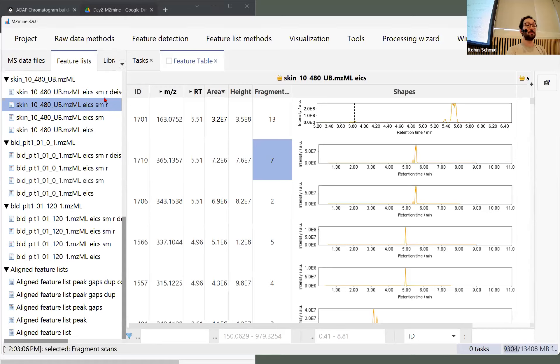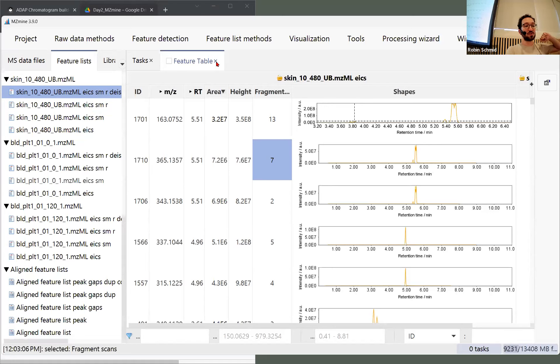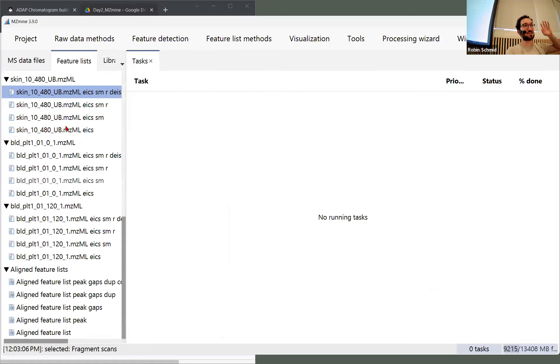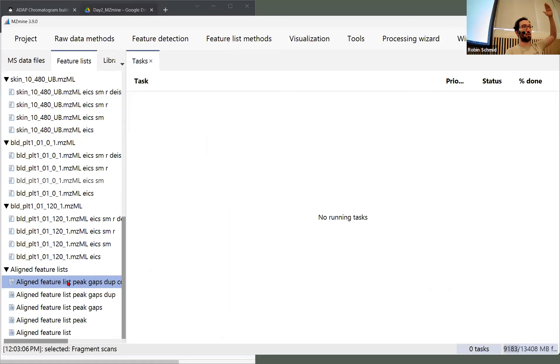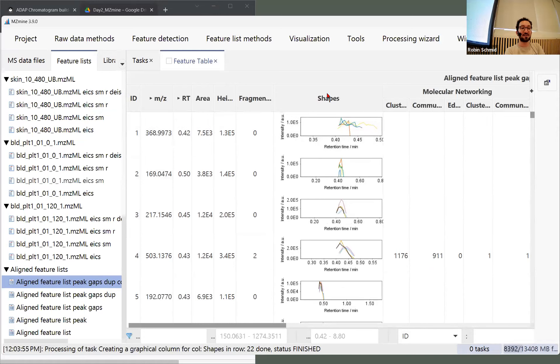Those suffixes are just set in the batch mode. We applied another filter — isotoping — and there are multiple more filters you can apply. But the most important feature list to open now is the aligned feature list. If you go all the way to the bottom there's the aligned feature list, gap fill, duplicate, correlated, and so on. Double-click on it, and now we're going to see shapes that have multiple samples.